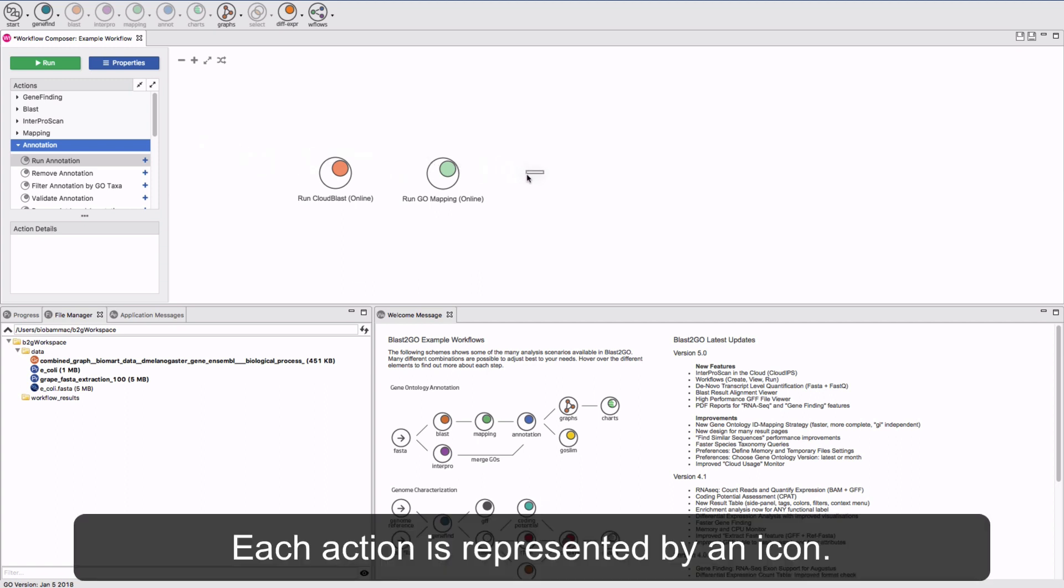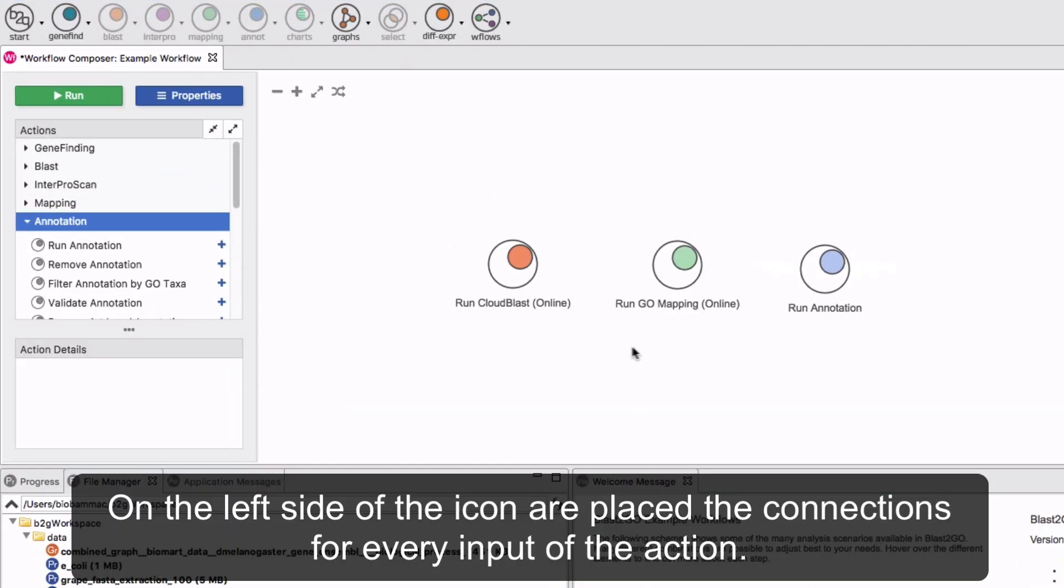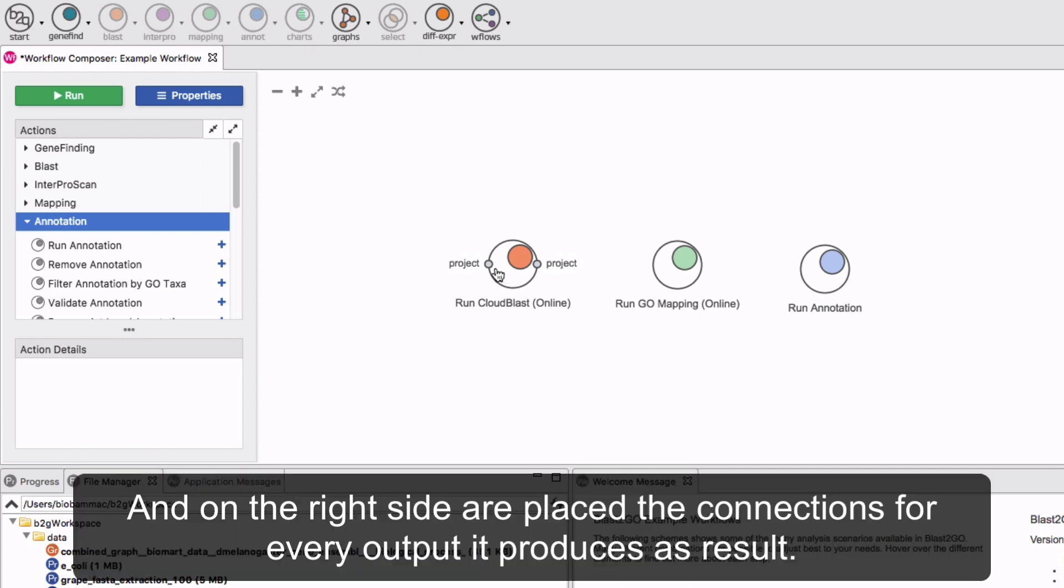Each action is represented by an icon. On the left side of the icon, the connections for every input of the action are found. And on the right side, the connections for every output it produces are found.